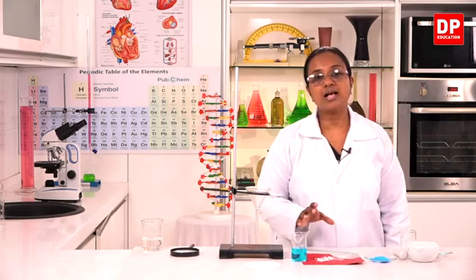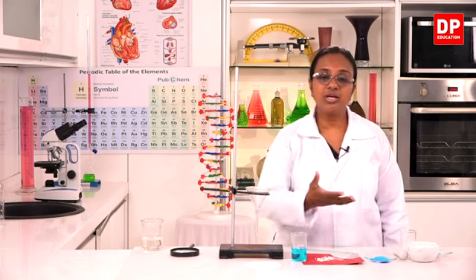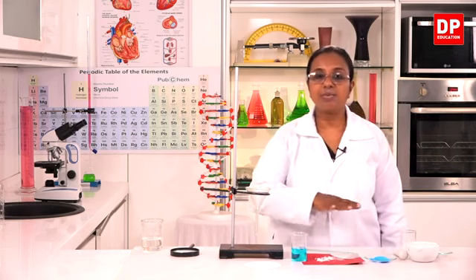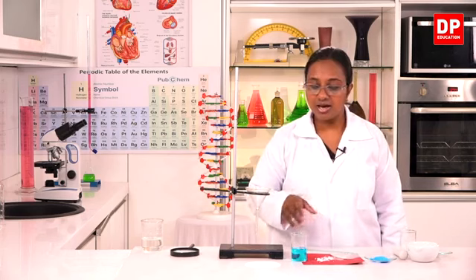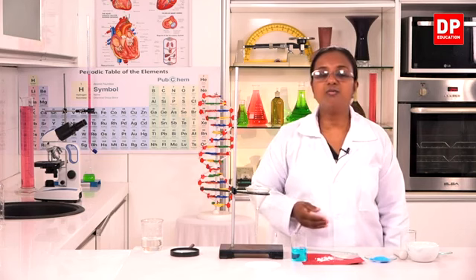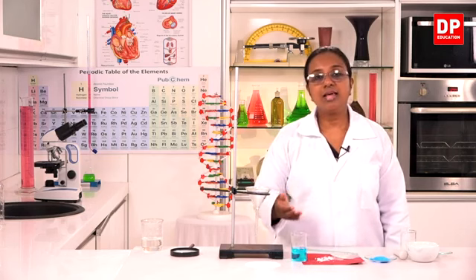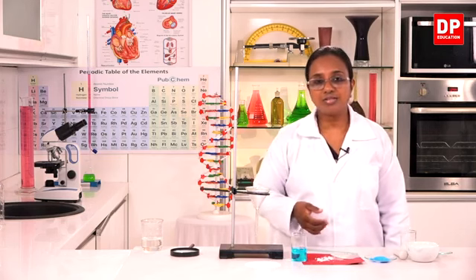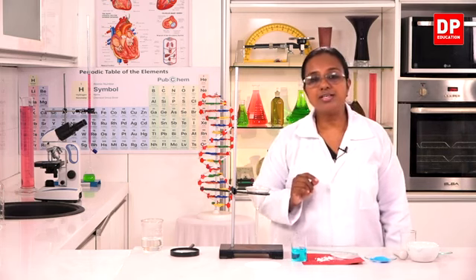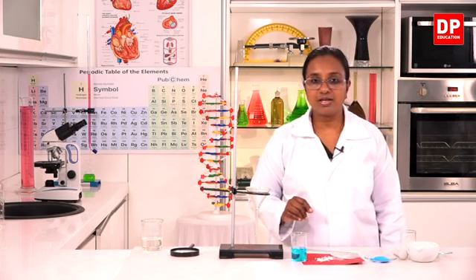Even this copper sulfate can be poured into a large container, one that is flat but has a larger area. You can pour it into that, and if you allow the water to vaporize, then you can get the copper sulfate crystals back. So these are all physical methods of separation.